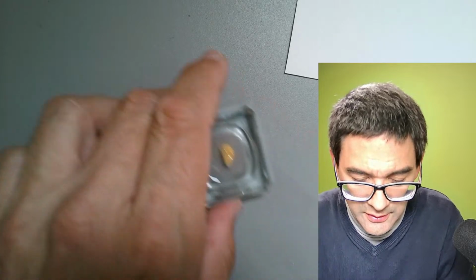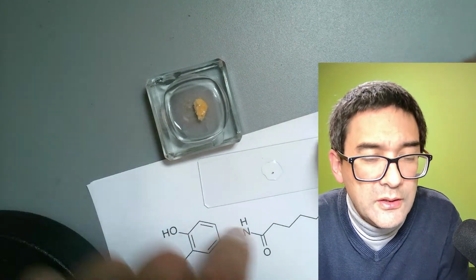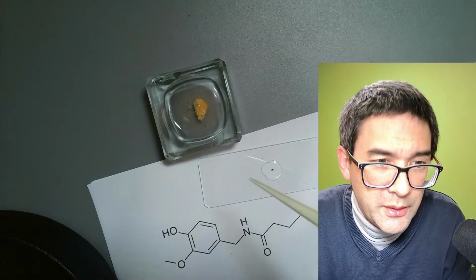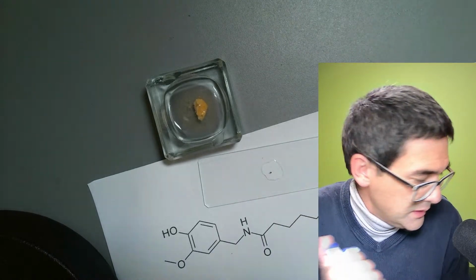Okay, so I can actually show you here. Maybe you're able to see it. Okay, here it is, this tiny little dot that you see here. This is now a fresh tip that I'm using here, and I'm going to simply take some of the water away.